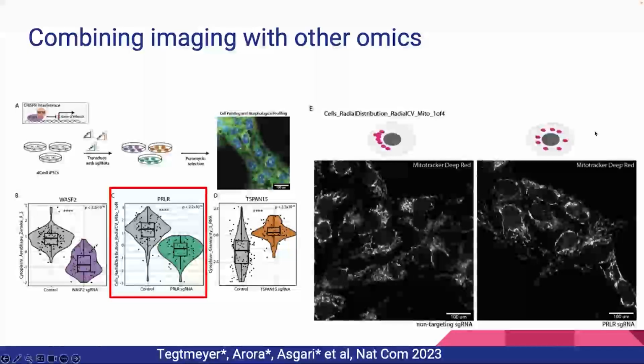In things that are, in this case, possible for humans to see. So 2 of these 3 measurements are human invisible. One of them is human visible, but also pretty hard. If you tell somebody, look at the area closest to the nucleus and see if the mitochondria are symmetrically or asymmetrically distributed right around the nucleus, many of you could do that task, and my boss can get these exactly right when we've asked her to unscramble them. But you would have to know to do that, and it wouldn't necessarily be obvious by eye that that was the task you should do to tell a patient from a non-patient.